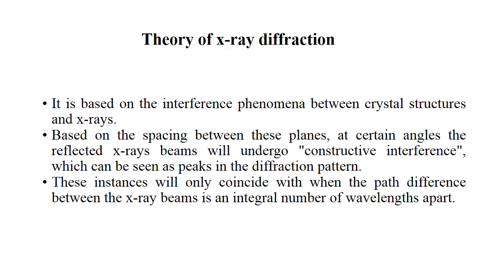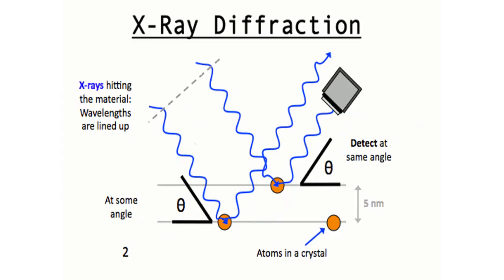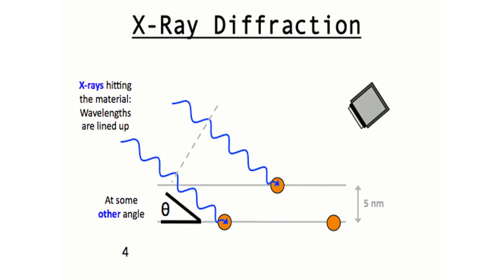The diffraction techniques, particularly those using X-rays, are the most important methods available to the inorganic chemist for determination of the structure. Here is the phenomenon shown by X-ray diffraction.